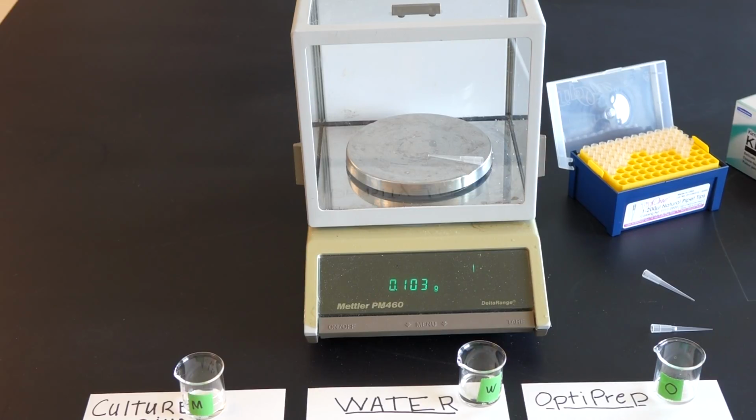And one of the side benefits is that these micropipette tips are very accurately made. In fact, they all tare out pretty much at exactly the same weight on this scale, so I wouldn't need to even tare the individual tips separately, except to correct for slight contamination of the scale pan, perhaps by liquid leaking out of the tip. Very good. That's a quick way of measuring the density of any aqueous medium.